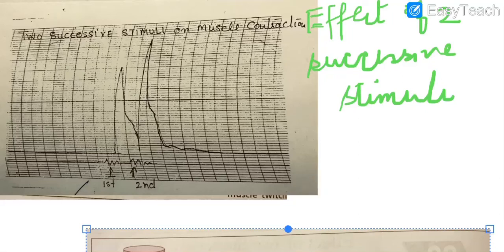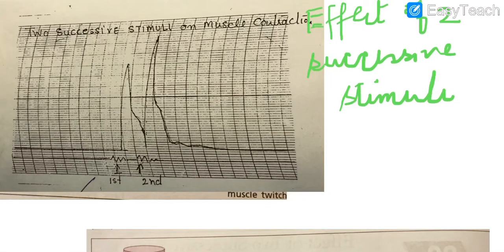Okay, now coming to this third graph. The first question will be to comment on the graph. So you should always start by saying this is the graph depicting the effect of two successive stimuli on muscle contraction. If we look at this, say this is the first stimulus, it has been marked over here. If you are getting this type of graph, this lower line, when there is a flickering over here, it means we are providing the stimulus.